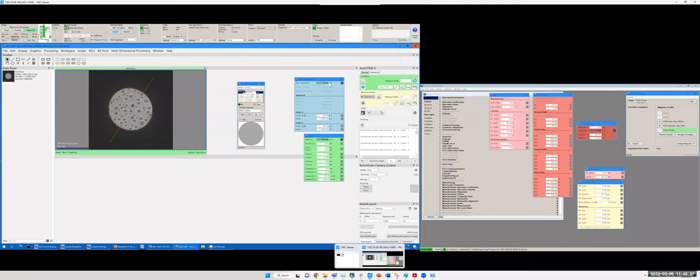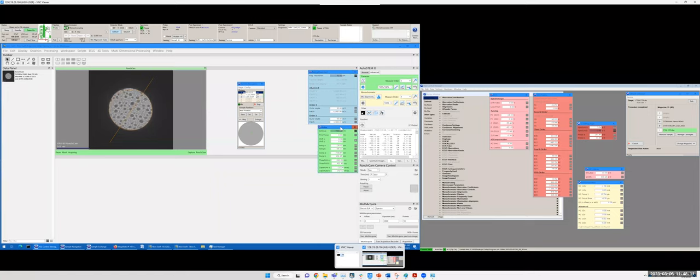Yeah, those are just my experience. In principle, I don't see any special stuff. You just need to constantly fix lower order and higher order. Just make sure the values are meaningful, because sometimes the values are totally wrong. So you just want to forget about those and do another measurement. As long as they're reasonable, you can just continue to measure and fix.